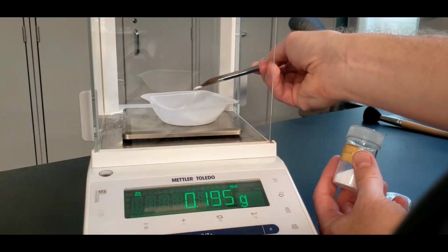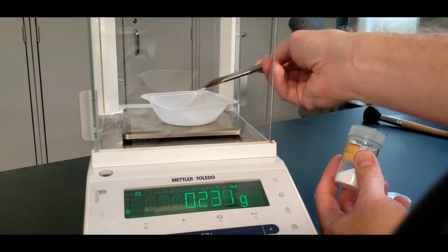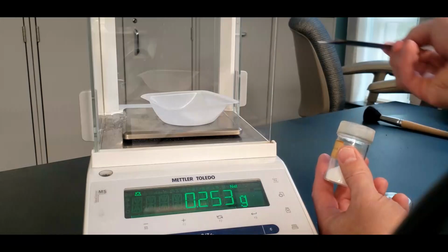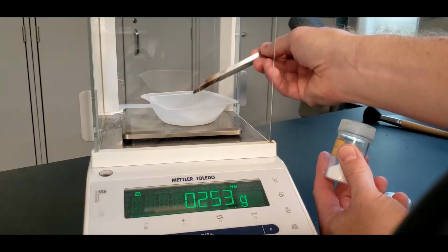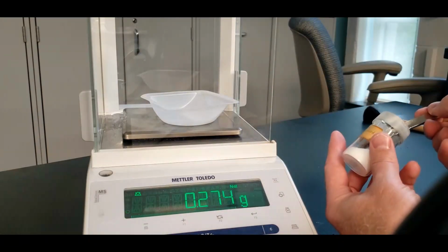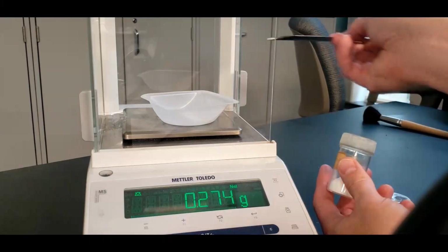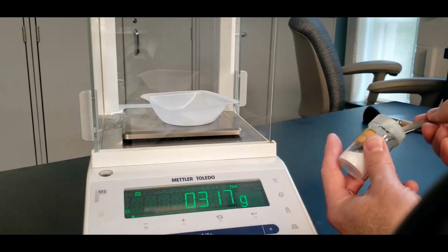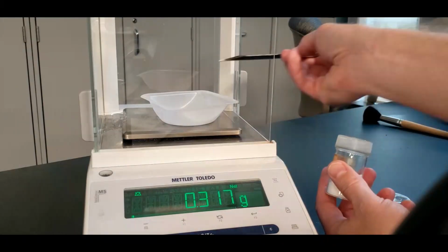The reason I use 0.4 is because you get a good volume of sodium hydroxide that's used, but not too much. So you want to have somewhere in the teens or low 20s. That's what we're hoping for here. If you use 0.6 or 0.8, you might end up having to refill your burette.